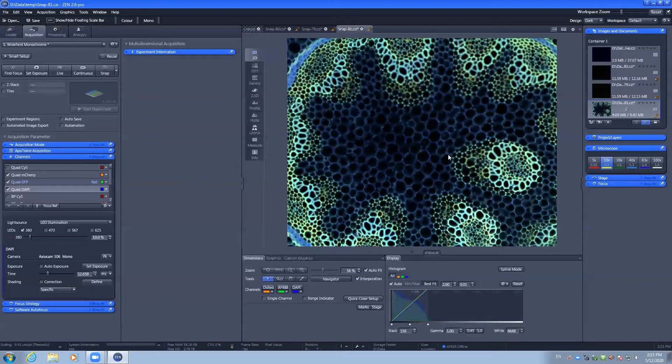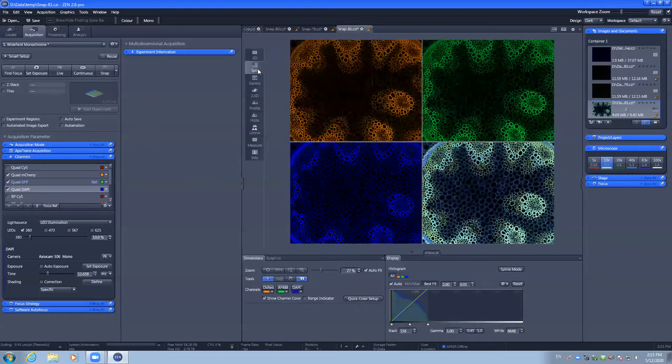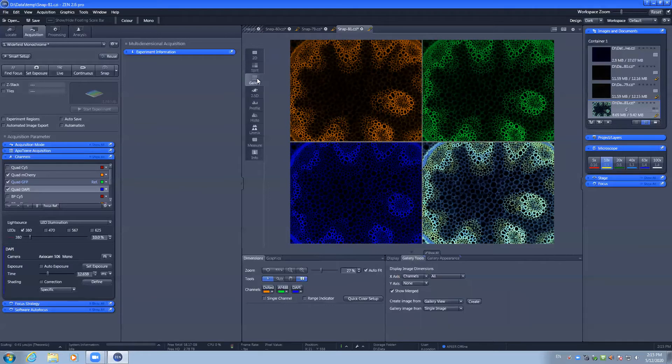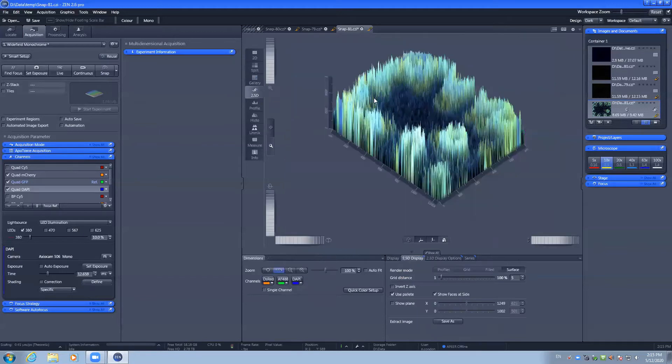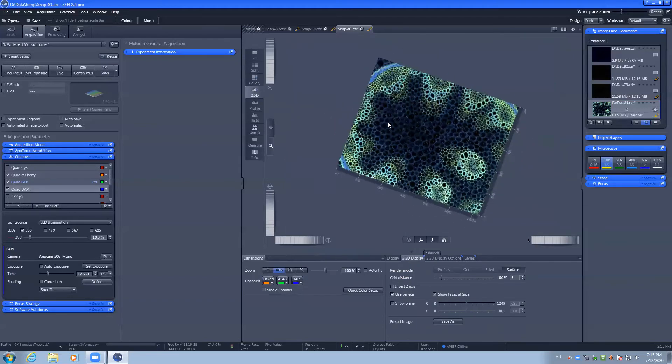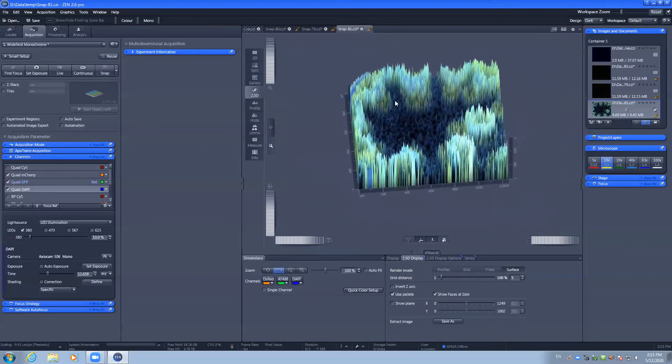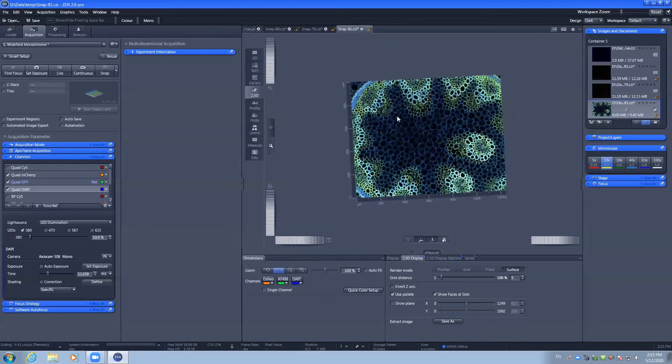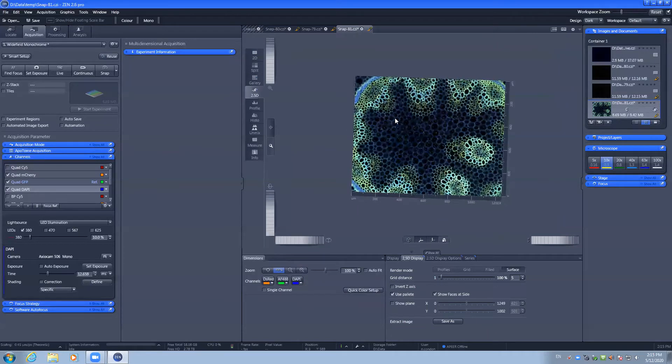The 2D image has the option to see the individual channels as well as a merge. Gallery view will show merged Z slices or time series. The 2.5D will show a 3D model of the intensity profiles of your image.